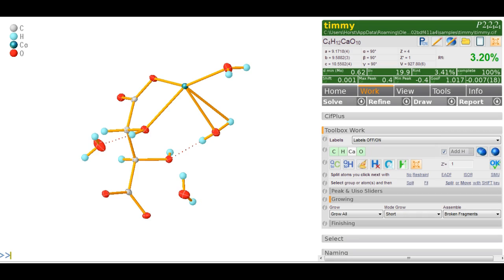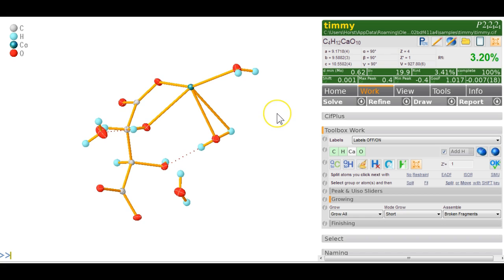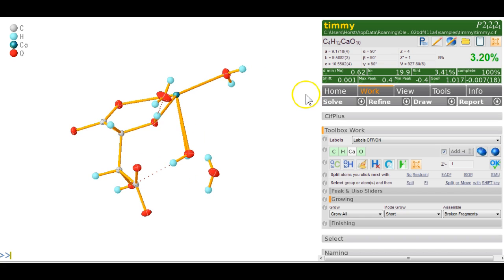In this video I'd like to show you how you can modify the asymmetric unit of your structure. Here we've got a structure called Timmy, because I collected it with the son of a very good friend. It's actually calcium tartrate out of a bottle of red wine.